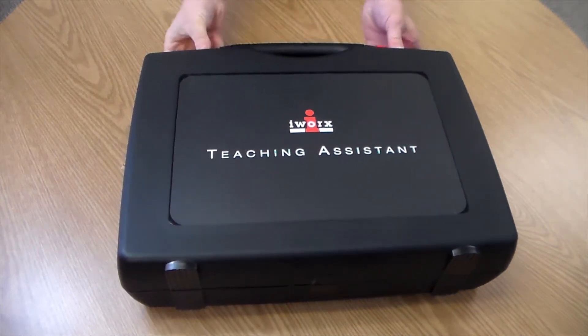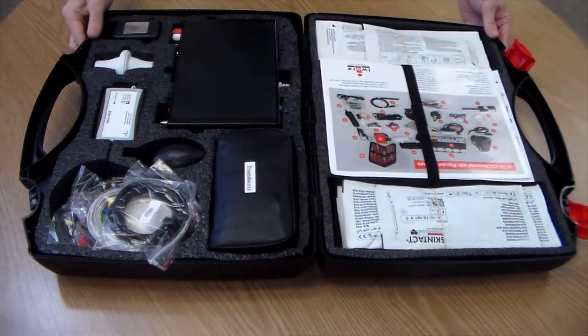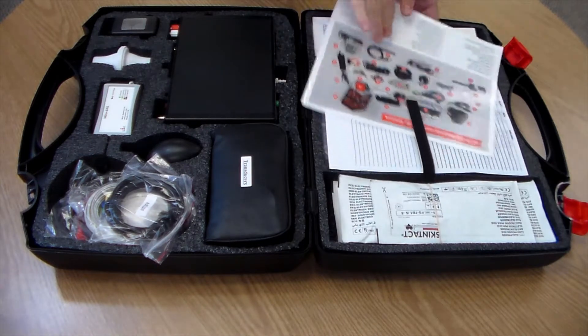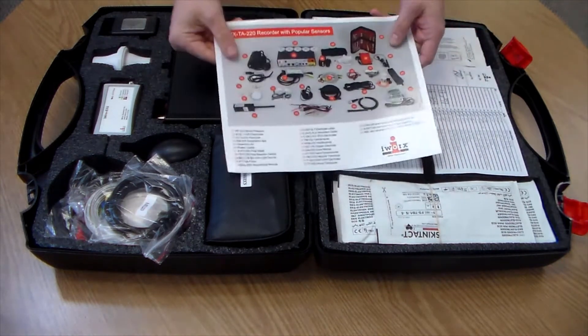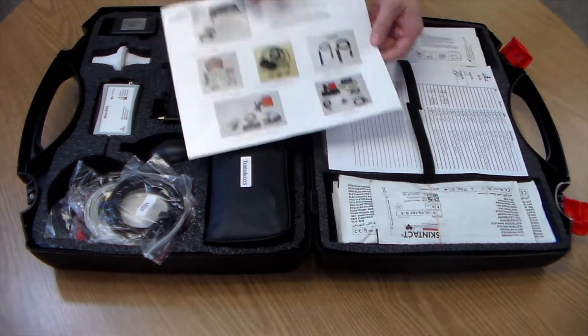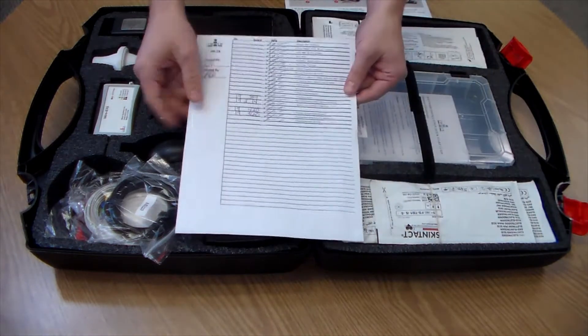Welcome to your iWorks teaching assistant. For this video we will be unboxing a standard human physiology kit. Each kit includes a full color guide to help identify the most popular sensors as well as options for future expansion. You will find a packing list with all the part numbers listed for easy reordering and easy inventory.